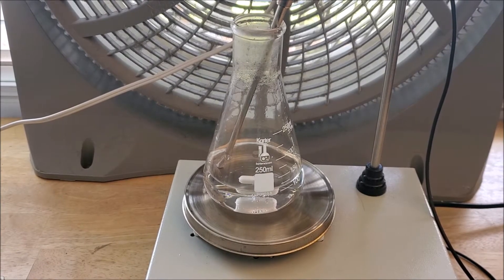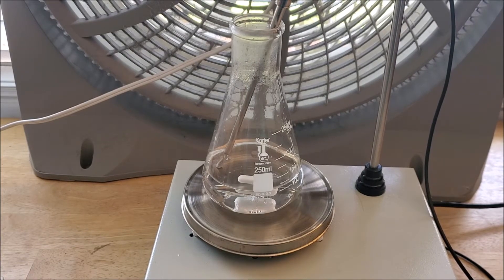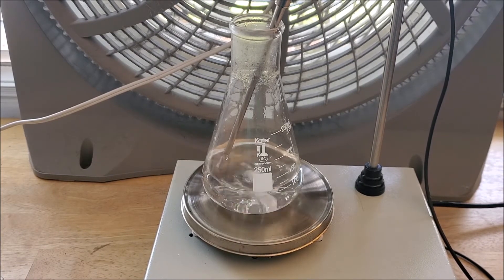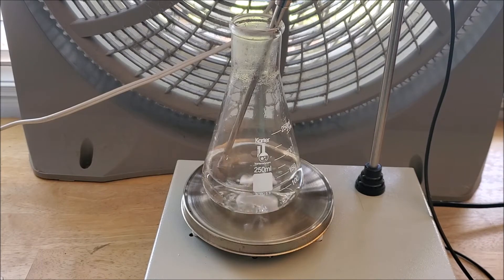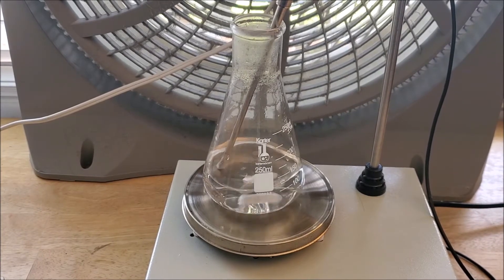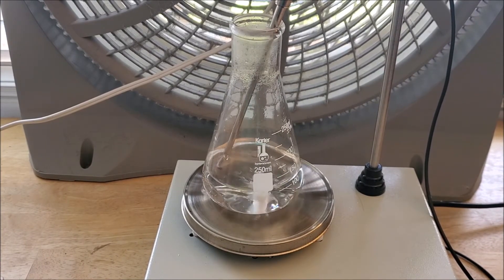All right, first things first, we're gonna want to add 100 milliliters of distilled water to a 250 milliliter Erlenmeyer flask. Next thing you're gonna want to do is you're gonna want to add 2.8 grams of the chromium-3 chloride to the distilled water.